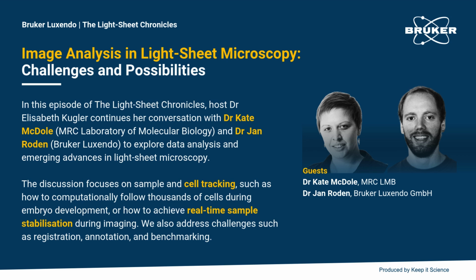So a core facility can have one of these light-sheet microscopes and a single recording could spit out 20, 30 terabytes. Where do you put that? And where do you put that long term? Specifically because most granting agencies require you to store data for 10 years, but try and get funding to repeatedly buy servers or cold storage or cloud storage for 10 years. No one wants to fund that. So then what do you do with that data? Do you put it on tape? But then that makes it very hard to access and very hard to share with other people.